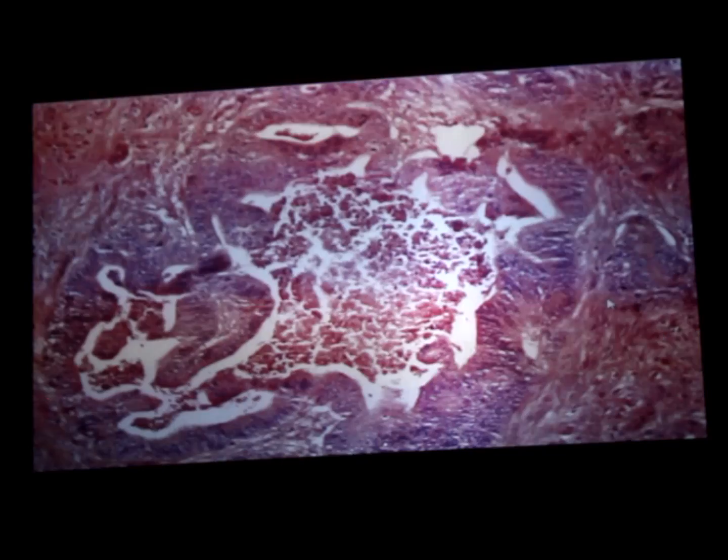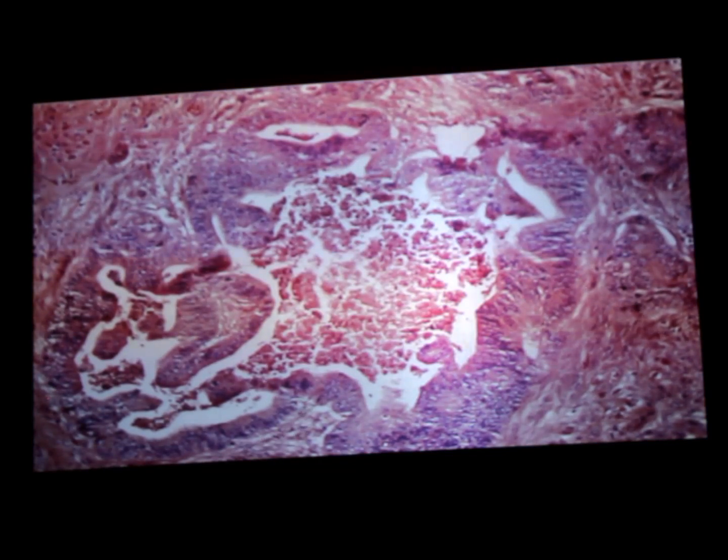Okay, this is presence of a blood vessel here. This is necrosis. These are glands. So cancer in the colon grows deep in all the four layers. Sometimes it comes outside. It may spread locally to organs inside the abdomen. Sometimes it may reach by metastasis to liver or lungs. So inside the colon you see all these abnormal glands with necrosis. This is the necrosis, central part. These are all tumor glands.